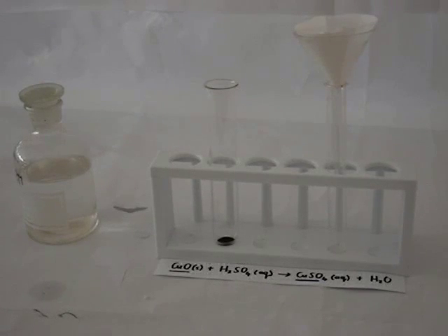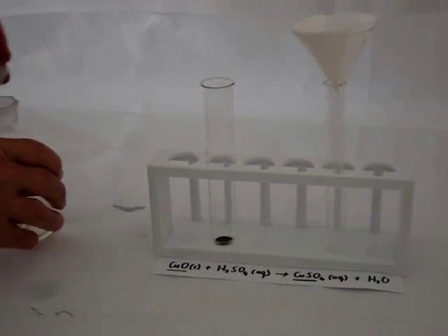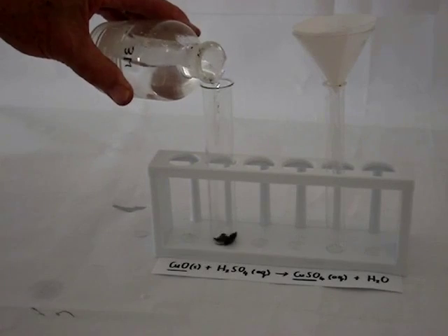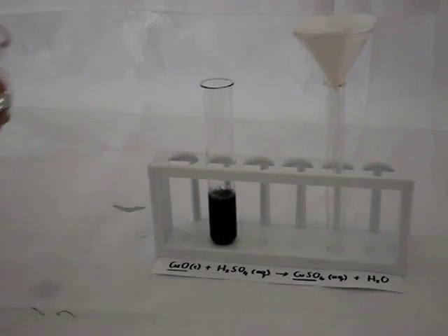Here we have copper oxide, which is a black powder, and we're going to add sulfuric acid. The two react together to form copper sulfate and water.